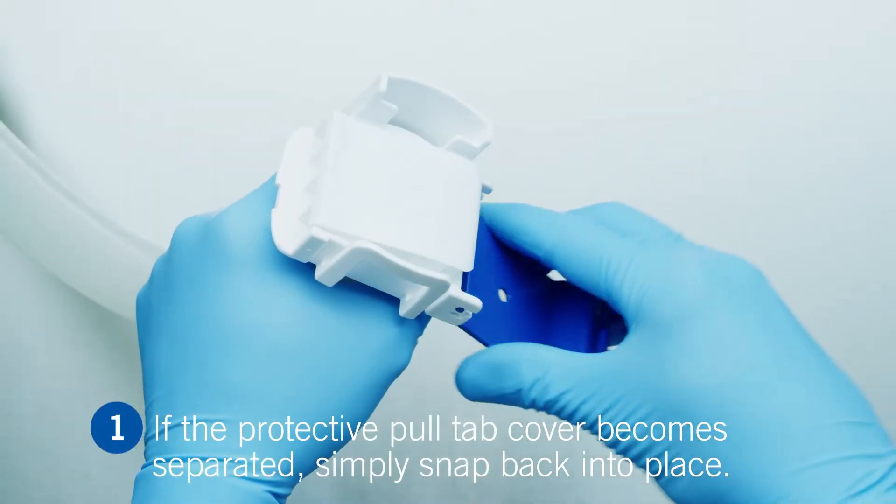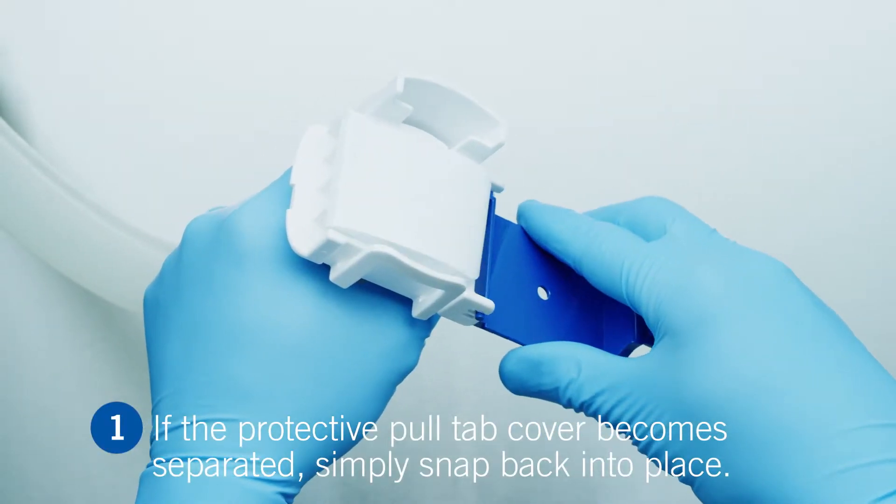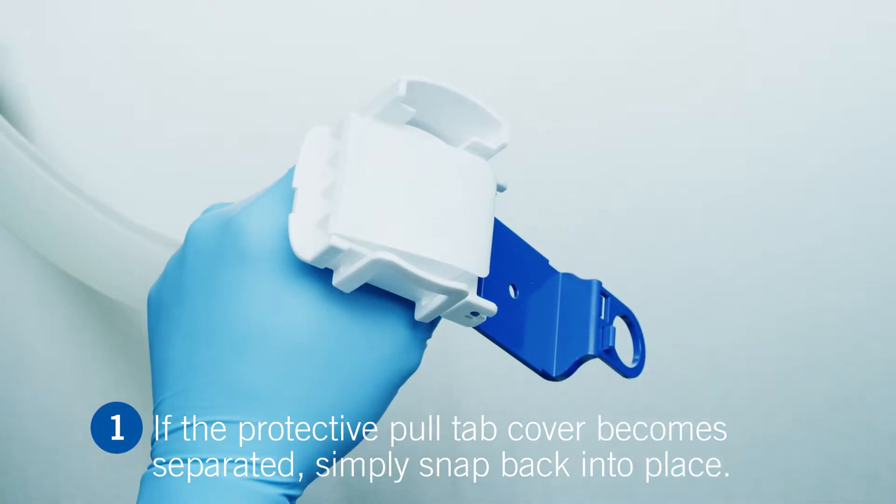If the protective pull-tab cover becomes separated from the connector during handling, simply snap it back into the hinges on the connector.